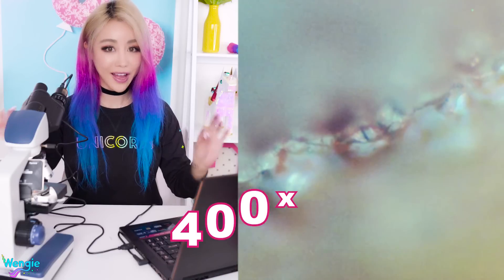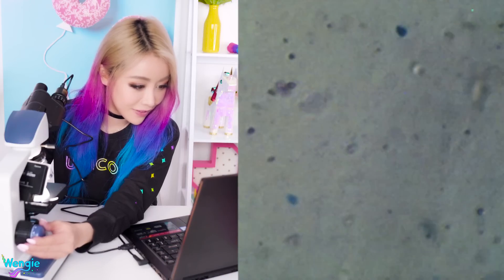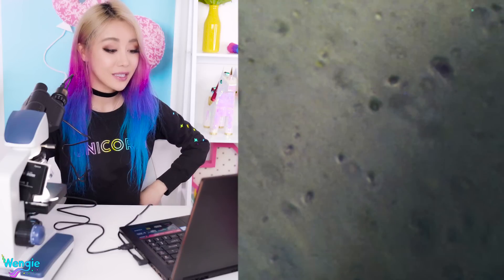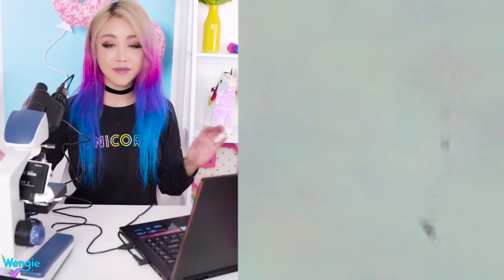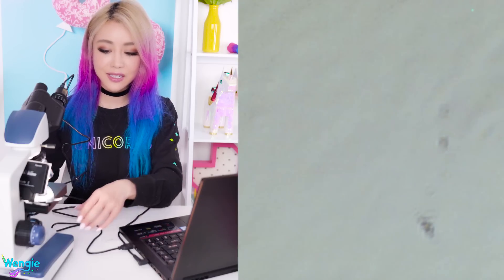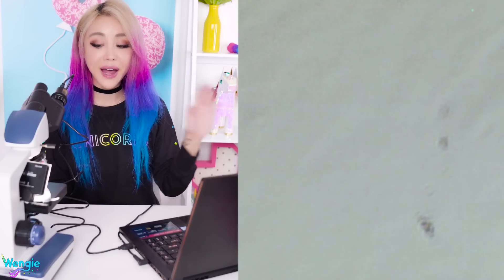Let's go 400x. I think we have vision — I'm confused. Is this the clear slime? My microscope is squashed against a foam ball. This is the surface of a yellow foam ball that's been squashed. So at 400x we can't really see much, and I'm doubting if we can even see anything at 1,000x. So we're gonna move on and just look at a single foam ball by itself.